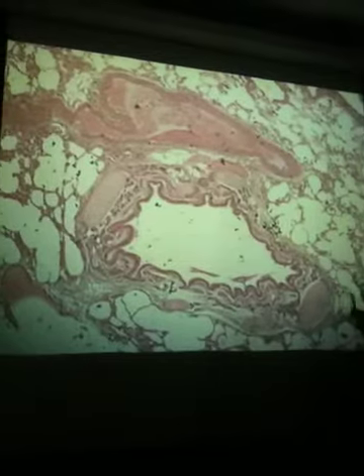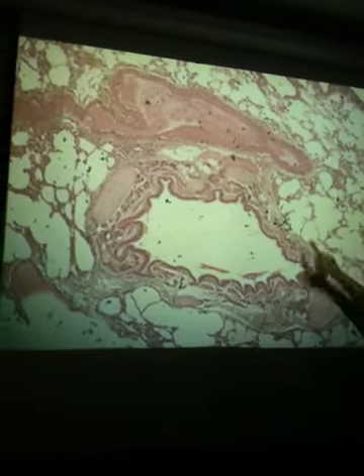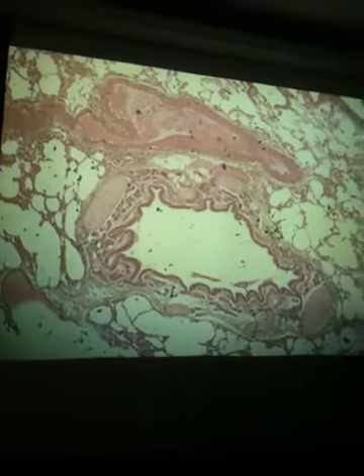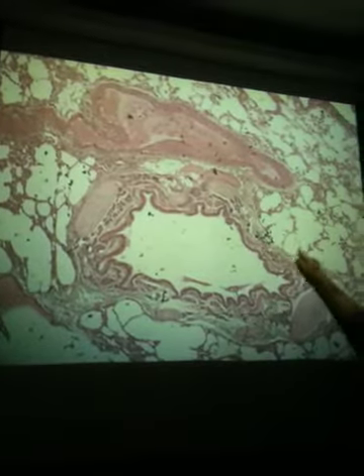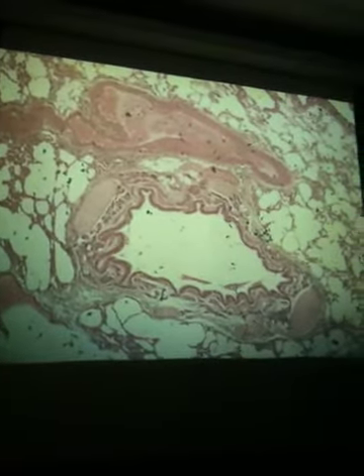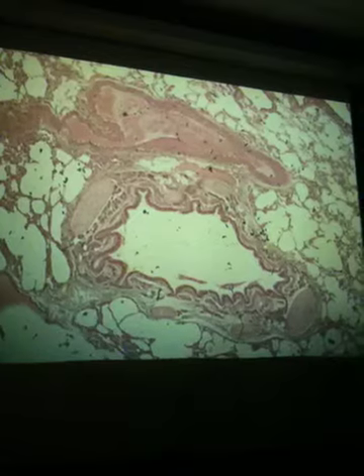First of all, the easiest one is to be able to find the alveoli, and this is the only place we really have a chance to test on it, so you know it's going to be there. These are all these big sacs. All these white spaces are the space, and then all of these would be the little alveolar cells. They're one cell layer thick, so we can do really rapid gas exchange across their surface.